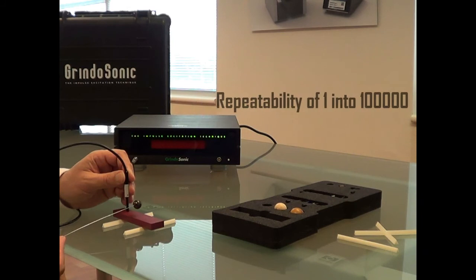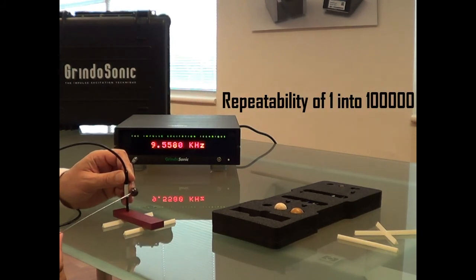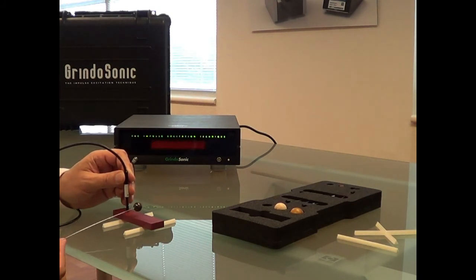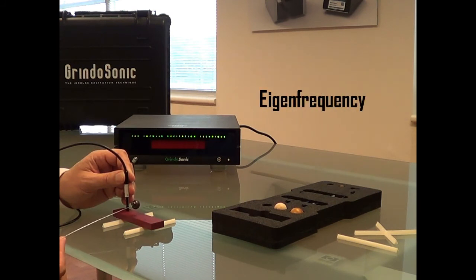We have a repeatability as you can see in this measurement of roughly one in one hundred thousand. The frequency, the measurement frequency, is the first eigenfrequency.